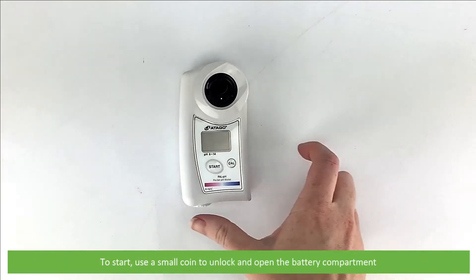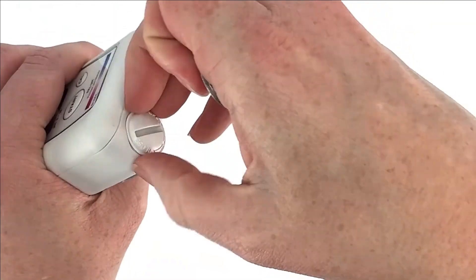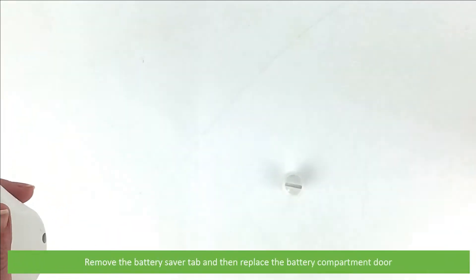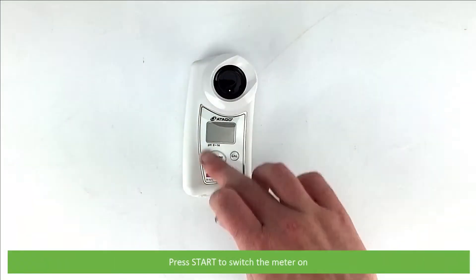To start, use a small coin to unlock and open the battery compartment. Remove the battery saver tab and then replace the compartment door. Press start to switch the meter on.